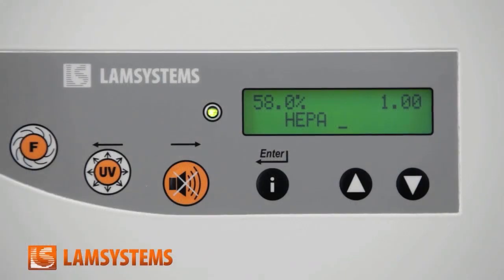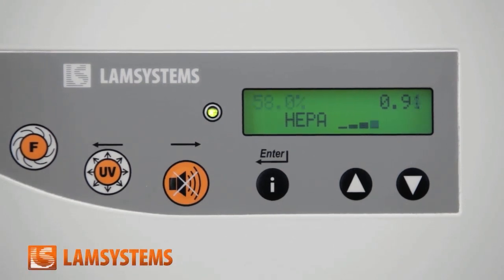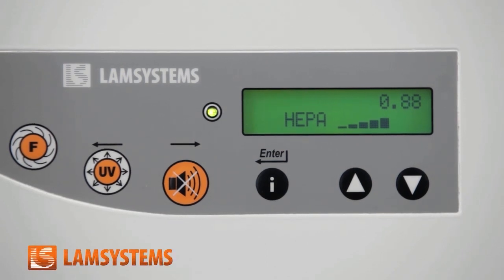The microprocessor control system monitors the contamination degree of the installed filters each time you switch on the cabinet. If the critical level is reached, which is about 90%, you'll see a message on the display.